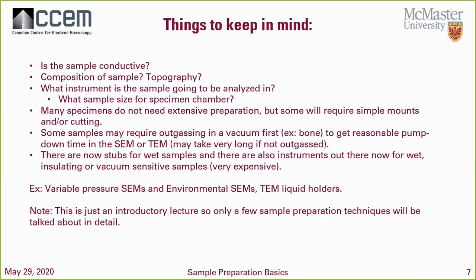What instrument is that going to be analyzed in, right? I need to probably measure the size of the sample to make sure that it fits in that chamber. Of course, with TEMs, you don't have that much limitation, right? You're limited to that 3 millimeter standard size of the holders. But for SEM, it also depends on the chamber, right? So I recommend everyone, before you start to summarize the path of sample preparation, have a good highlight of where that sample is going to go into, right?